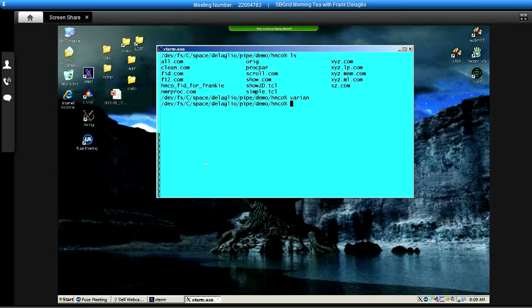All of the aspects of spectral processing in NMRPipe are conducted either directly or behind the scenes by the use of scripts. And the scripts are either C-shell scripts or TCL scripts. In order to process spectral data with NMRPipe, we start by creating a script that converts spectral data from the spectrometer format to the NMRPipe format.